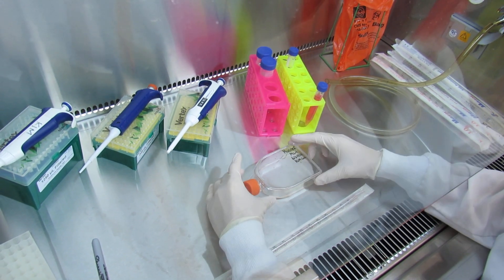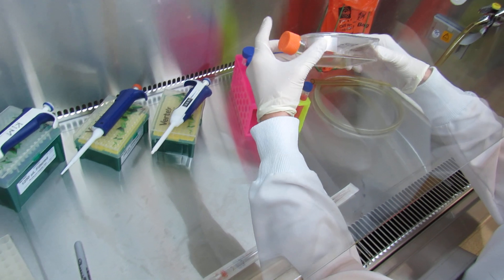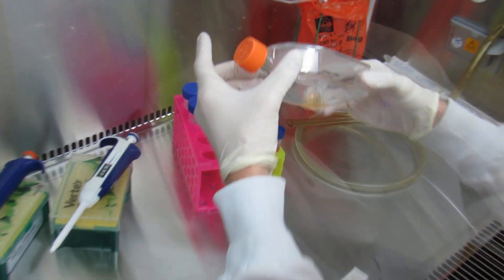After you've successfully trypsinized your cells and they have detached from the bottom of the flask, you will observe lots of gunk at the bottom of the flask. This is okay.